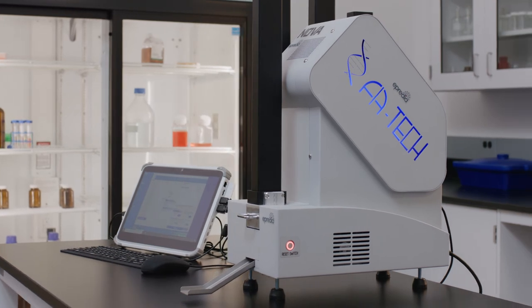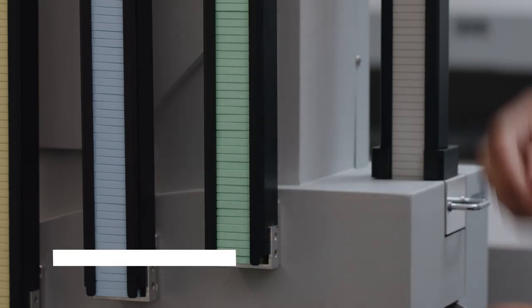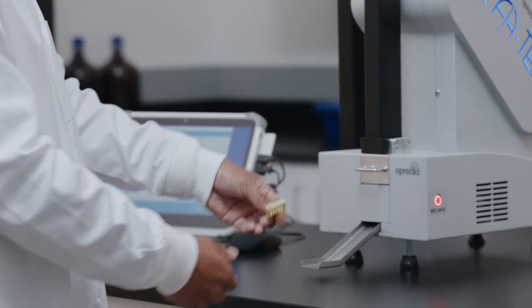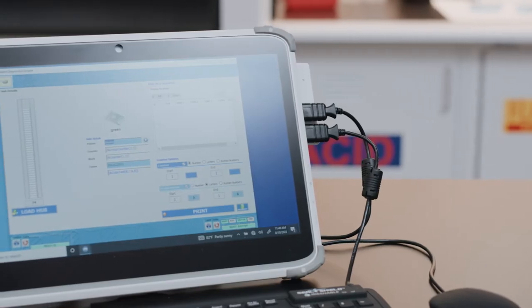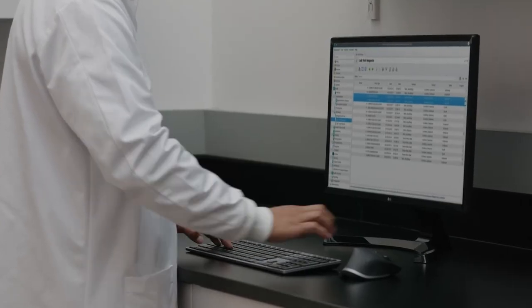The system offers quieter operation and a small footprint, so you can use it in areas where you need on-demand printing. Integrate the Nova printer with your LIS or LIMS for a truly seamless experience.